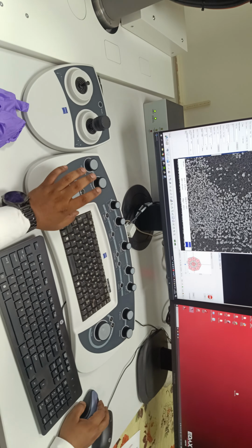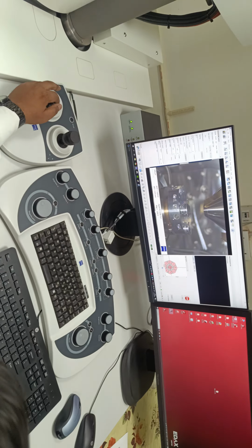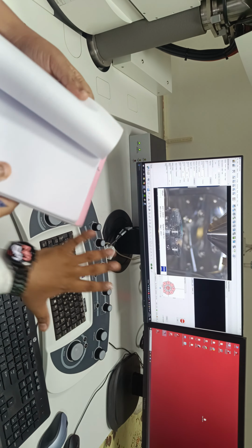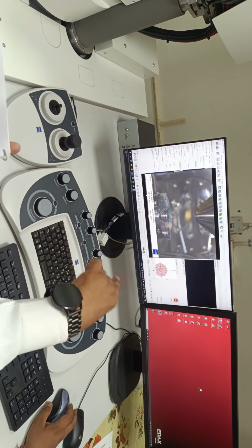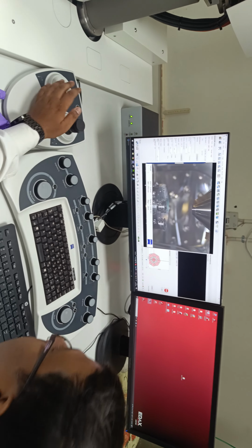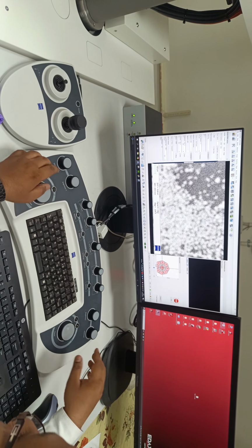Right now we are at a very low magnification. When you first insert your samples, you'll get something like this, and your stage will be very low. Now your WD may not be giving you the correct data. It is giving the correct data now because it has already been focused. So let's defocus everything. WD is gone. Now we will go to the secondary electron, select the ETD signal and try to focus it.